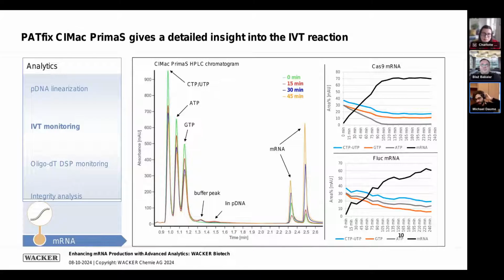Your mRNA elutes based on a change in conductivity and also in pH, and your gradient of the elution buffer. So your change of conductivity and pH doesn't happen at the same time, and that's why you have this offset. And you probably have two different conformations of mRNA which elute at these two different time points.